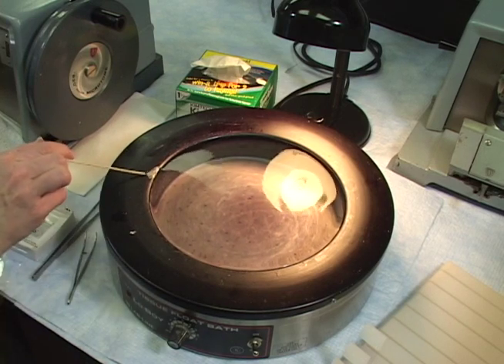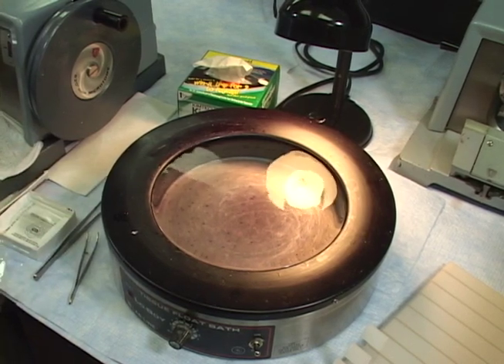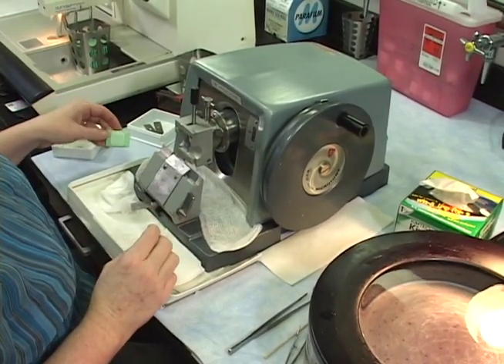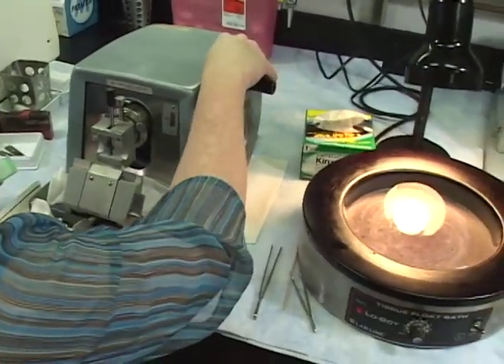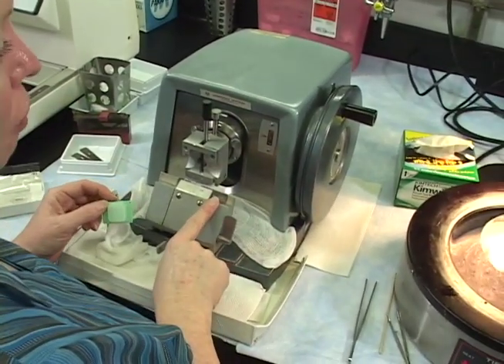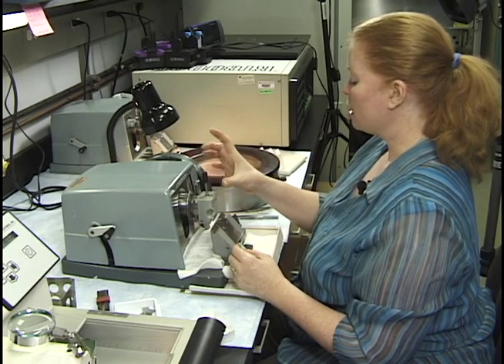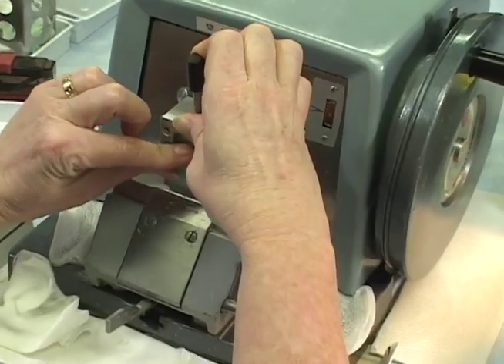This little bit on the edge doesn't matter, that's not going to hurt anything, but you can take your stick or your forceps and just scrape that off. And that's it. And then you can get another block. You put this in the locking mode. You lock it. You put a new block in. Now you can either take the blade out for safety reasons or as you're loading another block, but it is locked. Or you can leave the blade in. Again, you put your thumb on the face of the clamp. You push the lever forward and you put your new block in carefully.